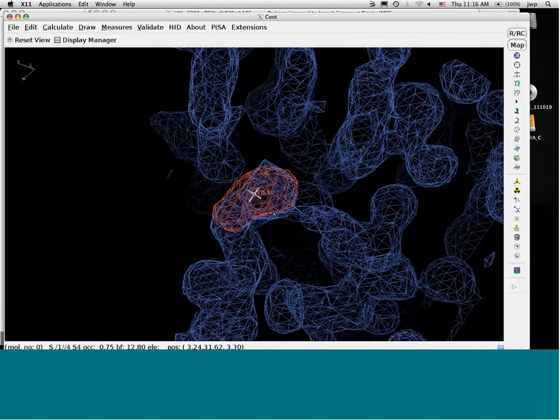So Arka actually commented on her twinning. It's non-merohedral twinning, so it's like a cracked crystal, yeah.